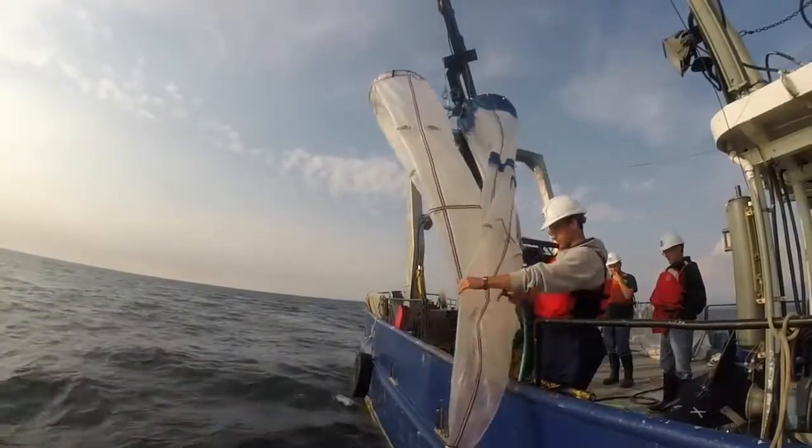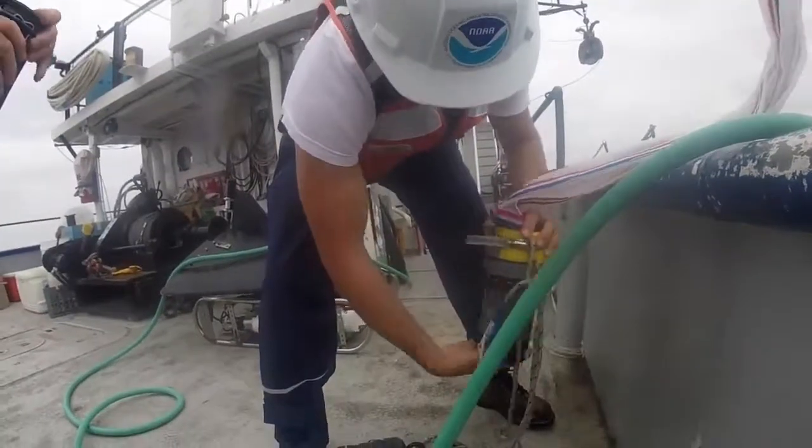Once the net is at the surface, researchers hose down the nets with water to flush all of the plankton into a tiny bucket at the base of the net, called a cod end.